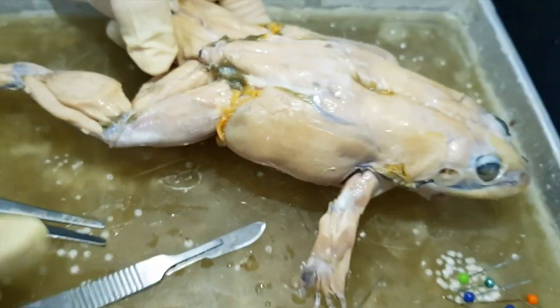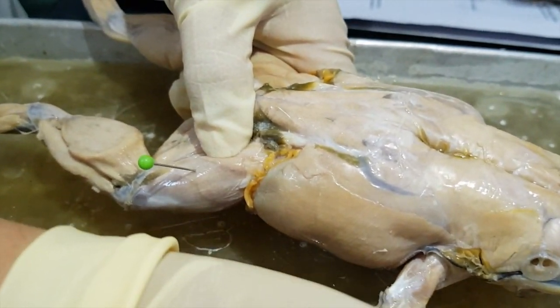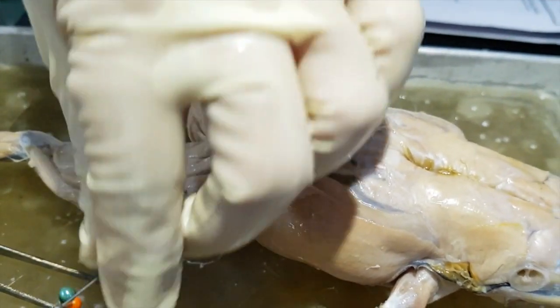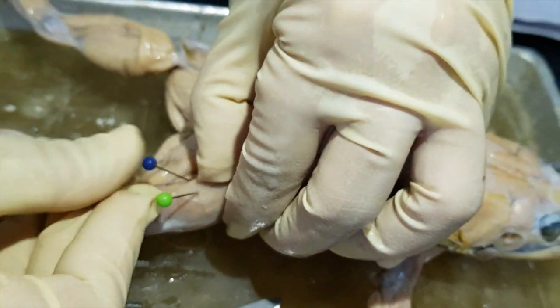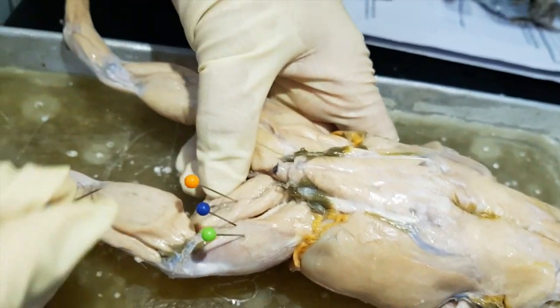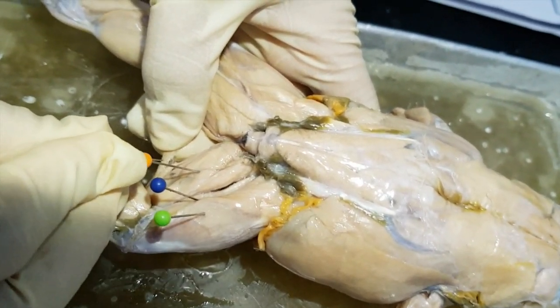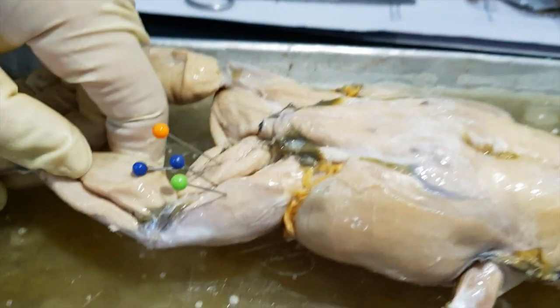Okay, so let's recap. Triceps femoris, biceps femoris, semimembranosus, and gracilis minor. Okay, then muscles of the shank.